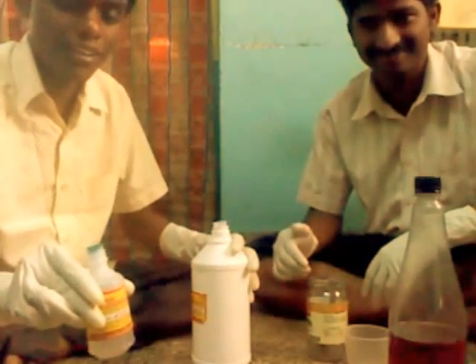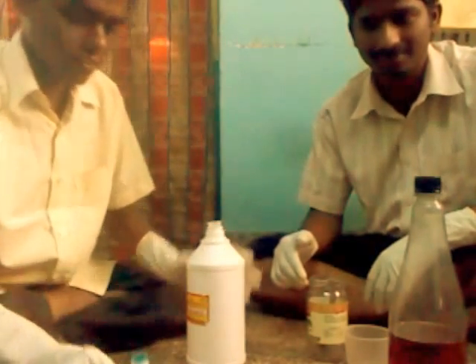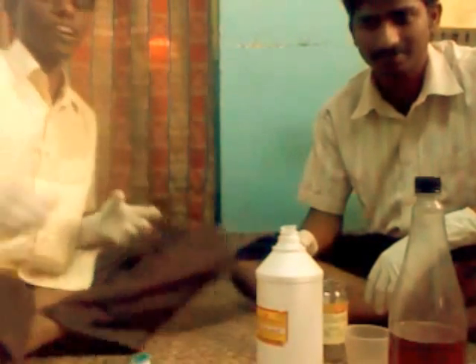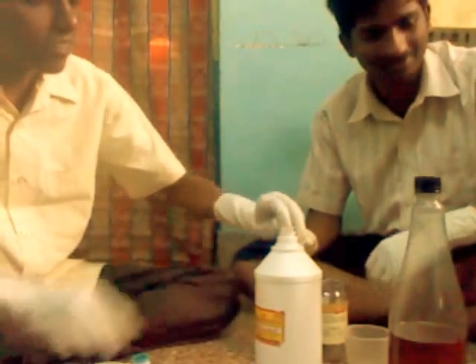This is lye — sodium hydroxide. For 1 liter of Jatropha oil we have to take an exact quantity of 250 ml of methanol.